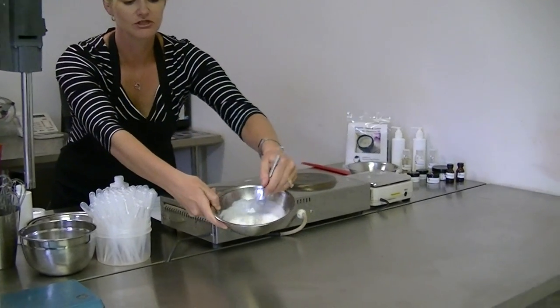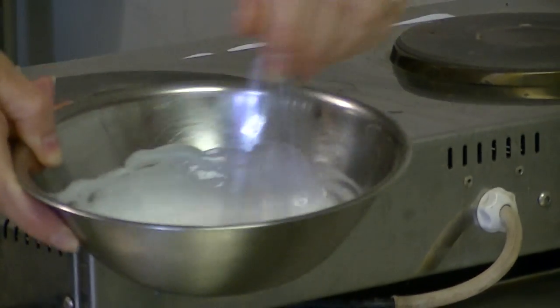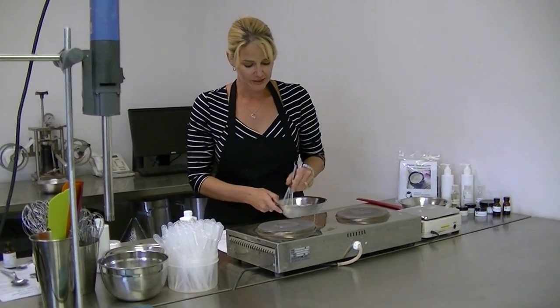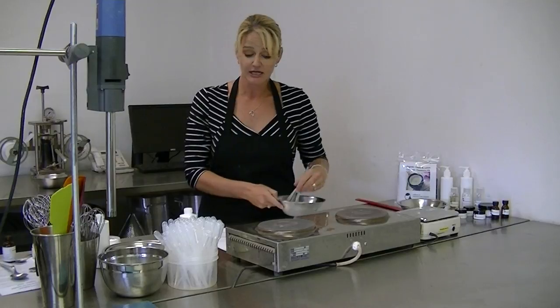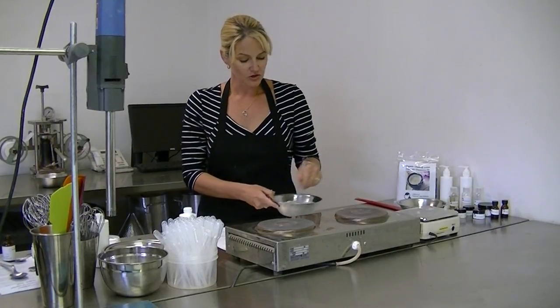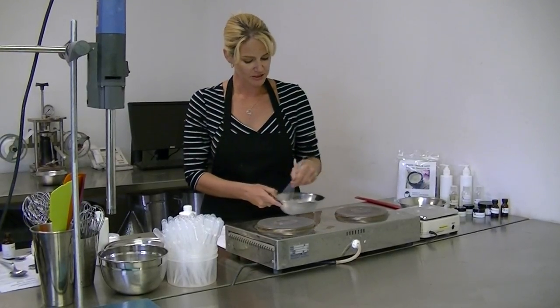I've formed my emulsion and I am still stirring to ensure that I've thoroughly mixed my oil and water phases along with the emulsifiers. At the moment it's still quite hot, and that's why it's still very liquid. I need to allow this to get below 40 degrees before I can add any fragrances, and specifically in this formulation I need to add antioxidants. We need to add antioxidants whenever a natural lipid or essential oil is used, otherwise you will get oxidation which could cause discoloration and off-notes in your finished product.